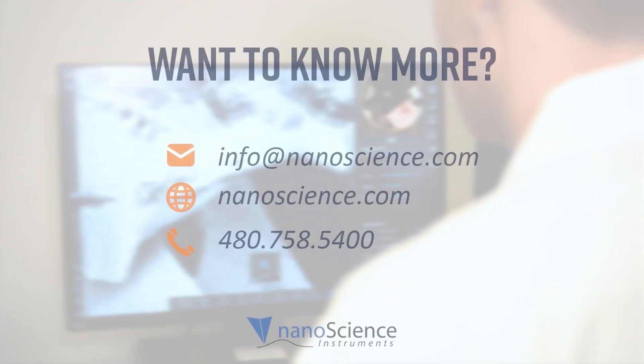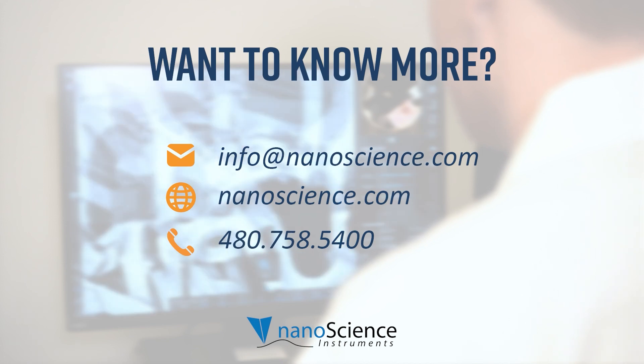I hope this video helped you gain insight into sample loading and getting started with SEM imaging on Phenom desktop SEMs.